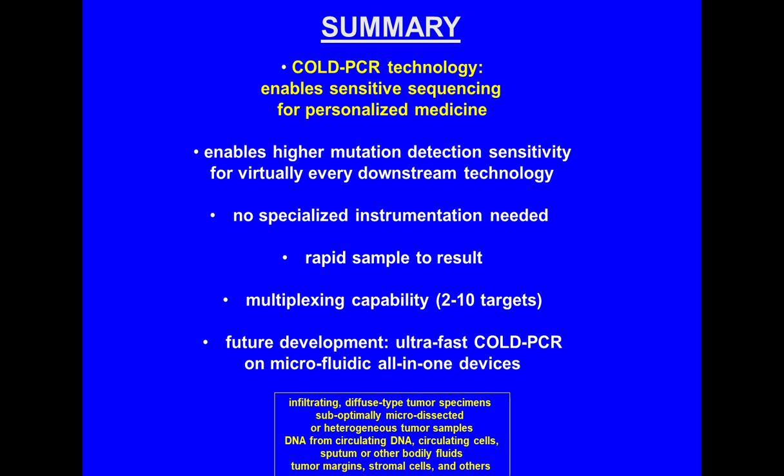At the bottom here, I have listed all the various specimens that one can examine. You have sputum, other bodily fluids that could be urine, of course, and liquid biopsies.